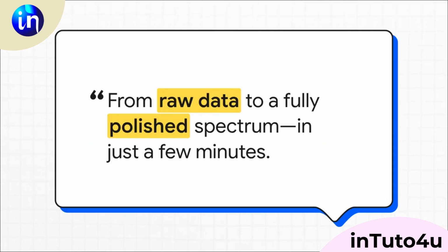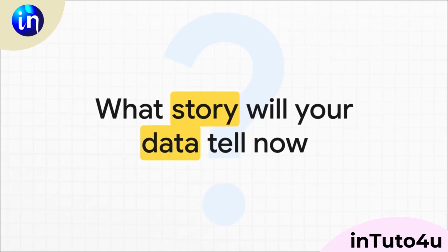And just like that, there you have it. We have gone all the way from a basic 2-column data file to a fully customized, totally publication-ready spectrum. And as you saw, once you know the little tricks, it really only takes a few minutes to pull off. So we'll leave you with this question. Now that you have the tools to present your data in a way that's clear, professional, and impactful, what story is your data going to tell? You've already done the hard science. Now you can go tell its story.